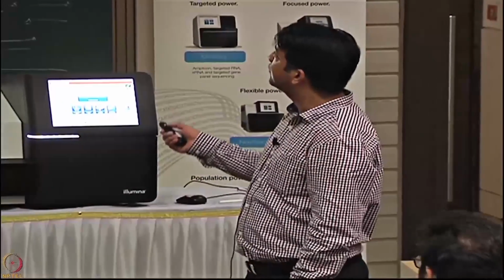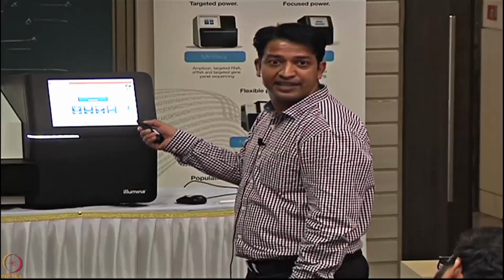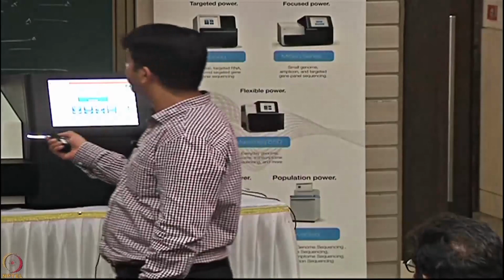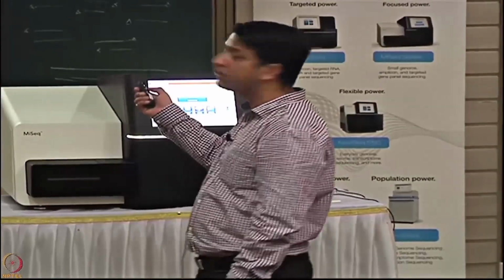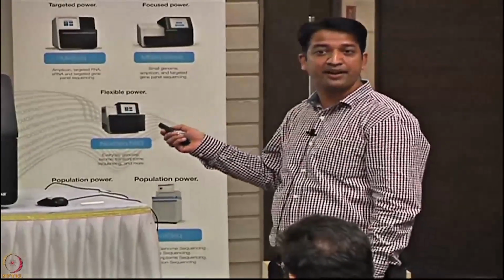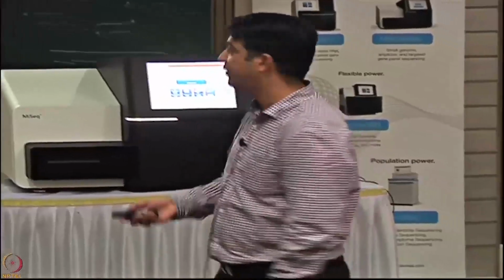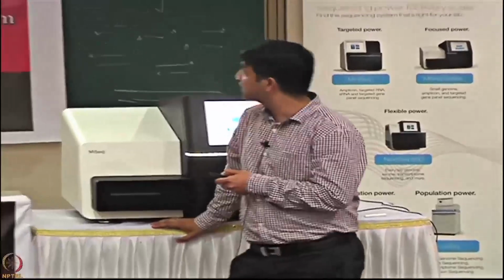What needs to be done is we denature it. Again, we will deblock this end. Clear? Again, it will flip because we have deblocked the end, and you can see multiple clusters will be generated. But this time we are going to cleave away the forward strand. Initially, we had cleaved away and gone for the sequencing of the forward. Now we cleave away the original forward strand, and this is how we are ready for sequencing the second read.